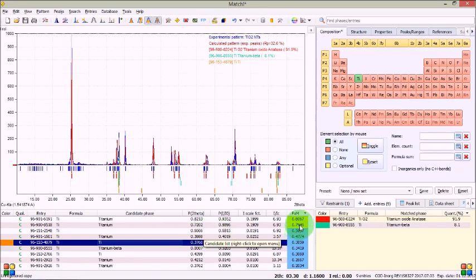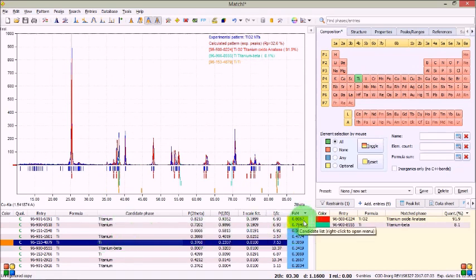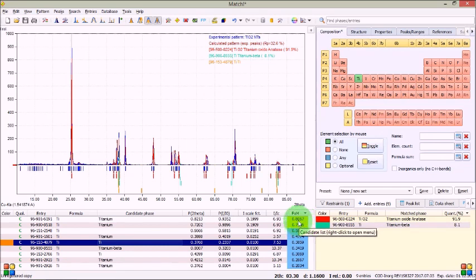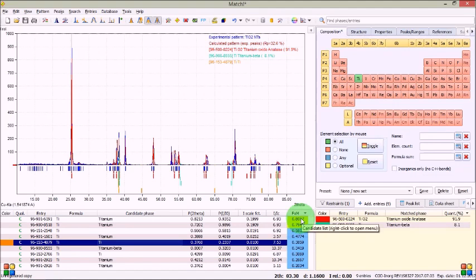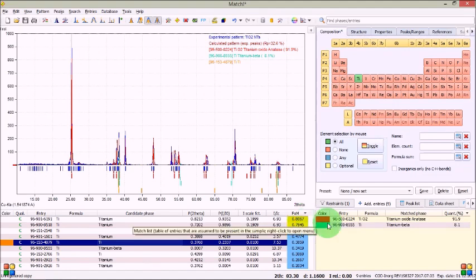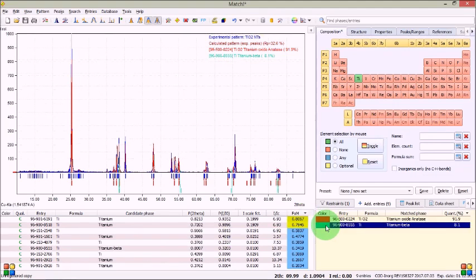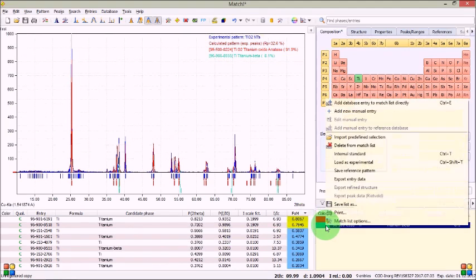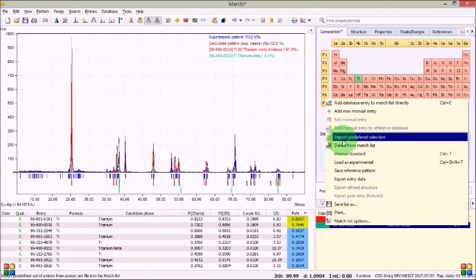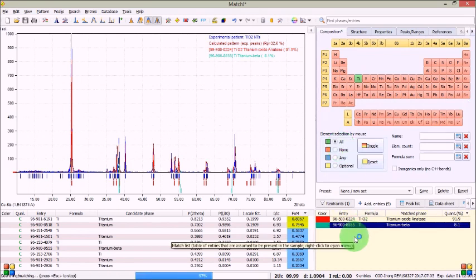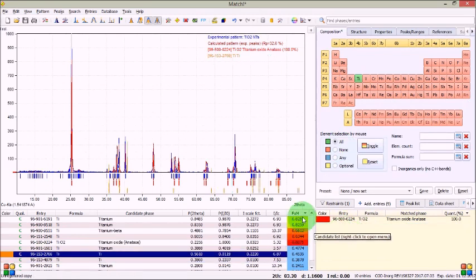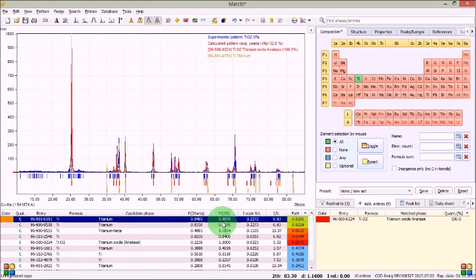Look, look, the formula matching is 0.8067. This is the highest formula matching so I should select these actually. So I am deleting it, just right click on it and delete from match list and it will get deleted. Then I shall choose this one. You can see, let's drag and drop it.